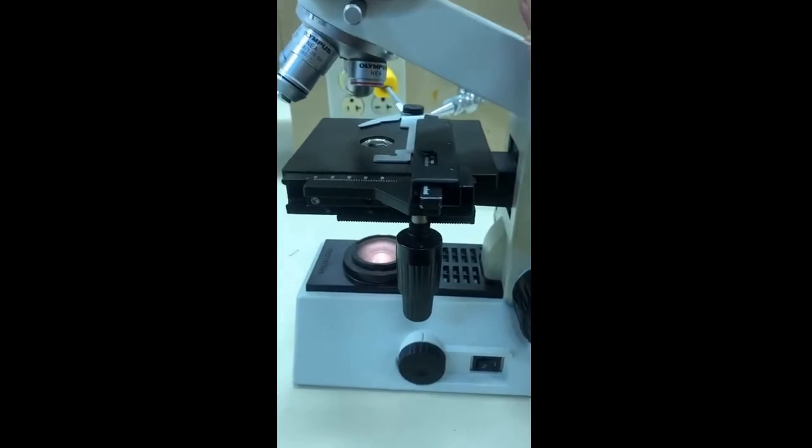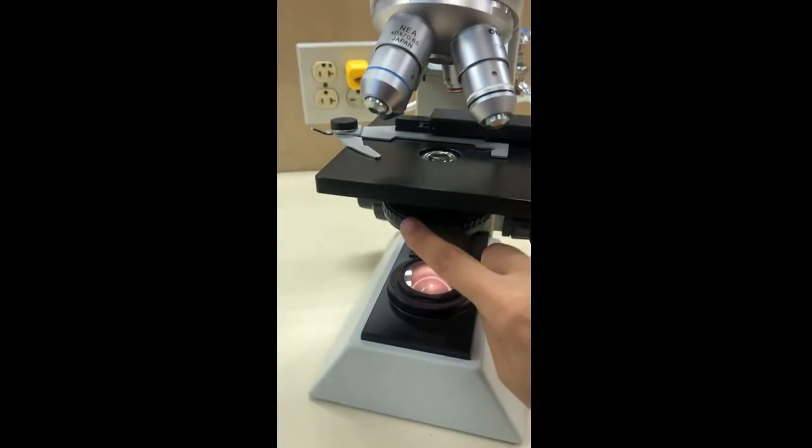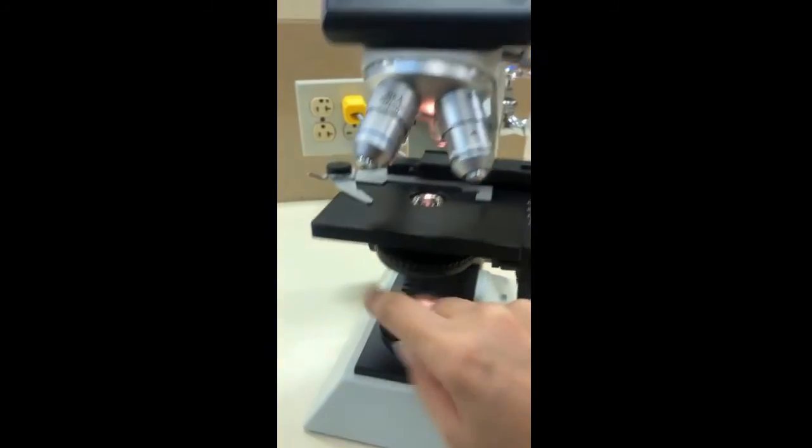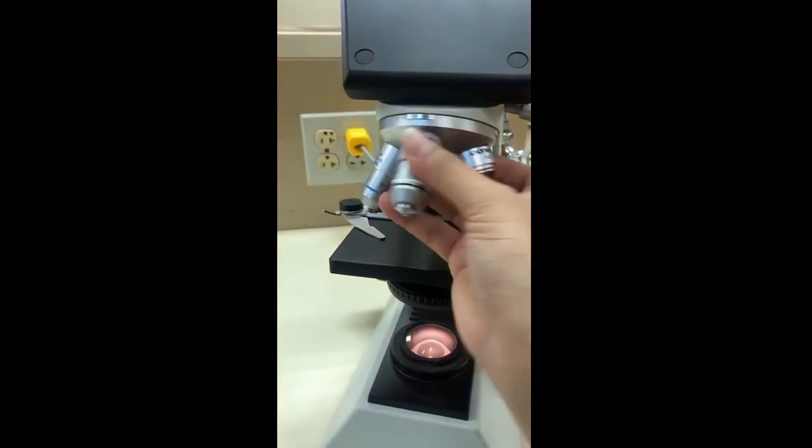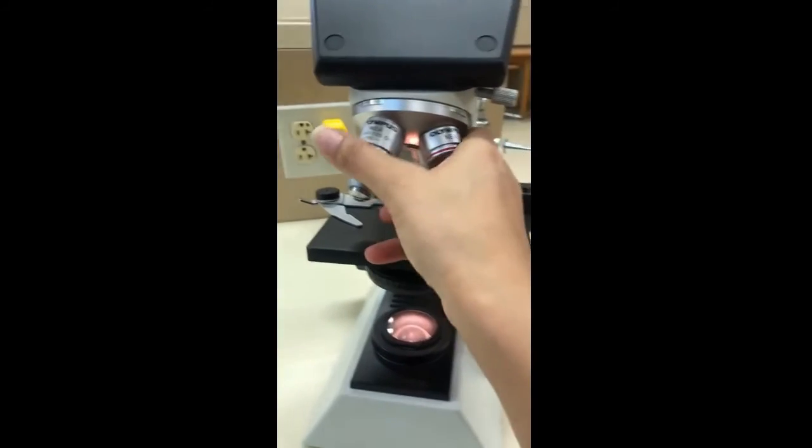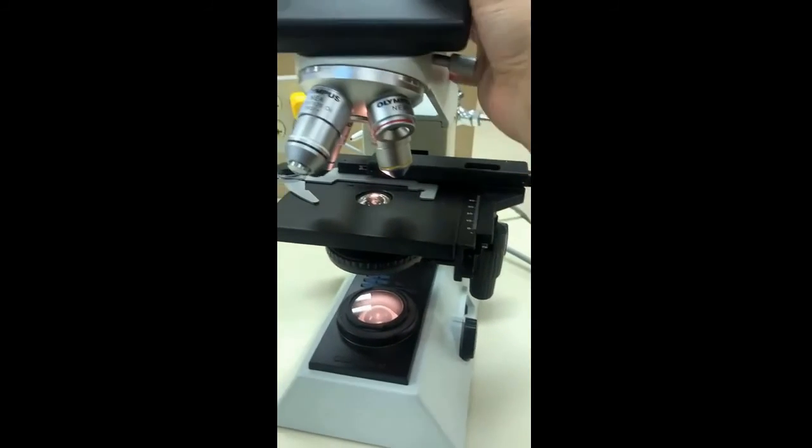Now here you can see the diaphragm that controls the light. Up here is the nosepiece. This is a compound microscope.